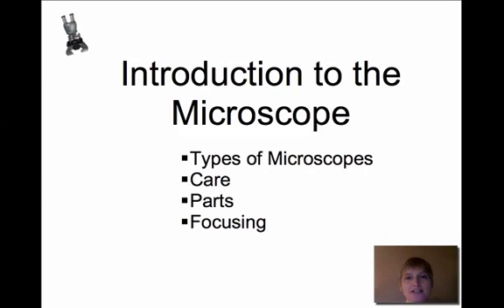I'm Kim McIntosh, and I teach biology at Shadow Mountain High School in Phoenix, Arizona. And today I'm going to talk to you about the microscope and tell you how we're going to be using the microscope in class.